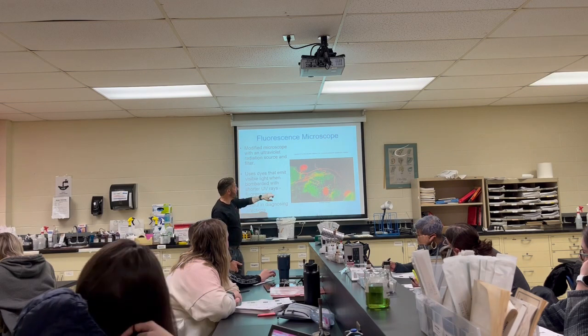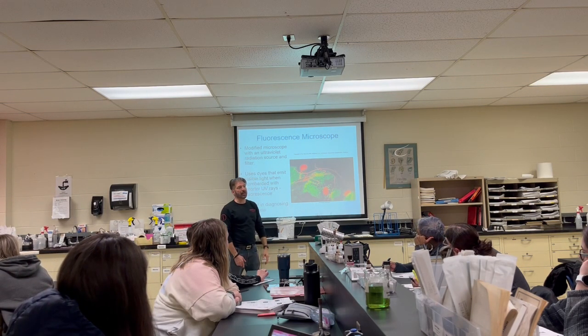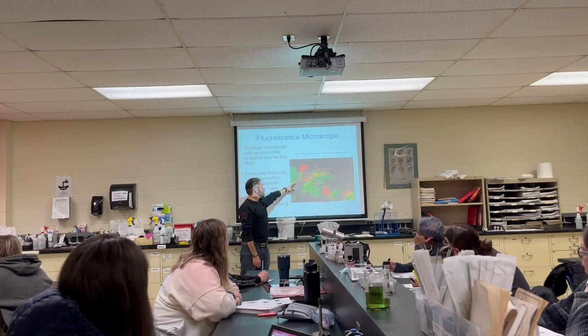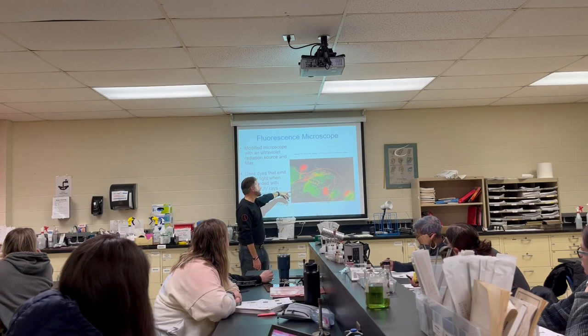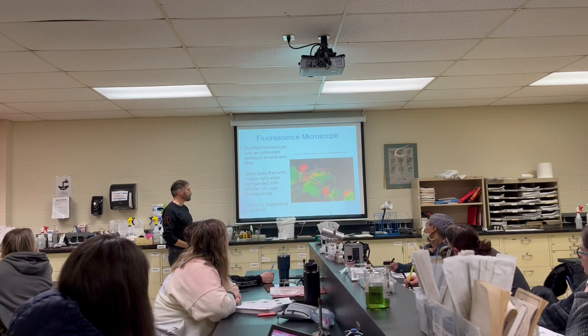So, with this, can you at least see the different shapes of the bacteria? We can all sort of agree these are circles, sort of. I'm going to call them cocci from now on. No, we can't see that? No? These are a little bit more rods, so you can just see the different shapes of the bacteria.